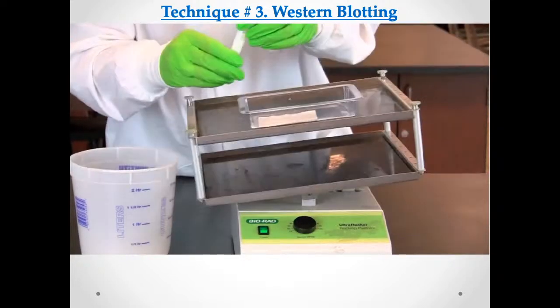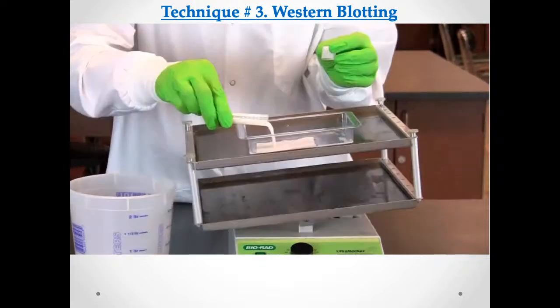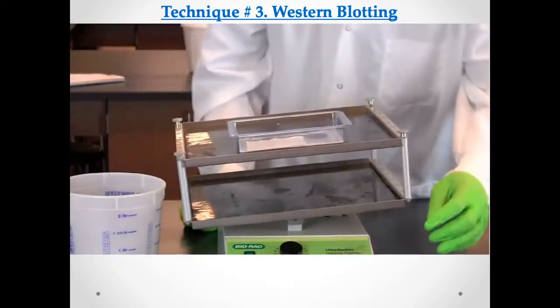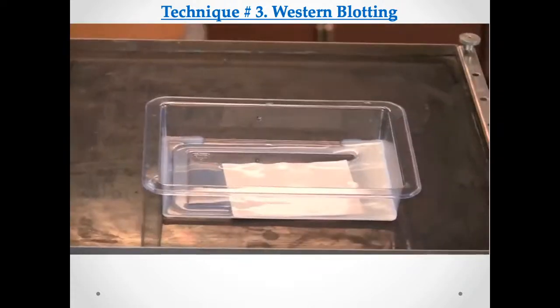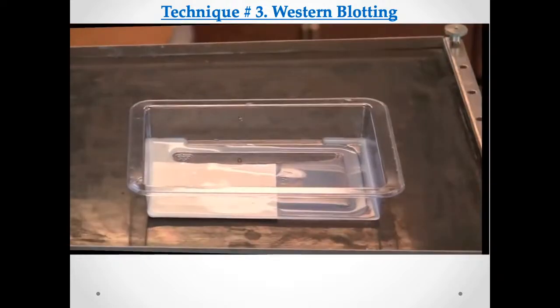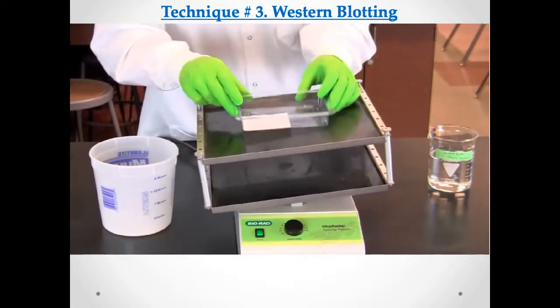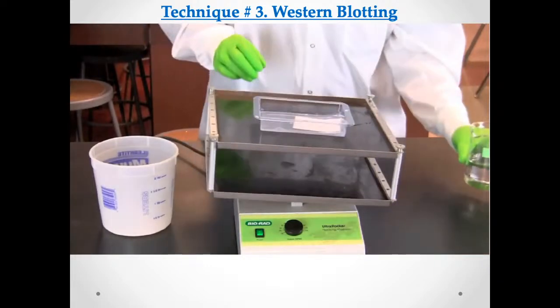Add 10 milliliters of primary antibody. Incubate for 10 to 20 minutes on a rocking platform. The platform should be set at a faster setting to ensure constant coverage of the membrane. Pour off the primary antibody. Rinse the membrane quickly in 50 milliliters of wash buffer and then discard the wash buffer.